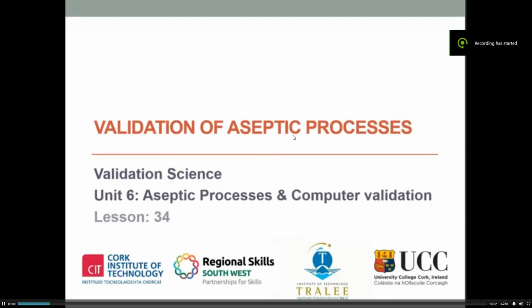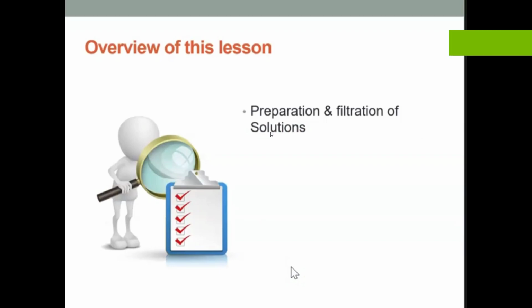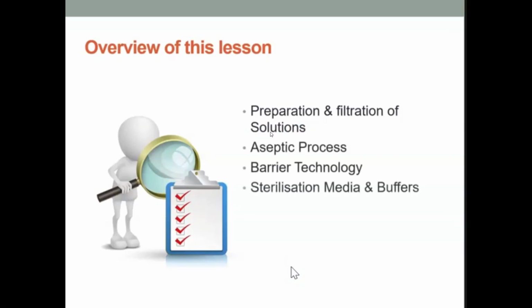Welcome to Lesson 34, Validation of Aseptic Processes. In this lesson, we're going to be looking at the preparation and filtration of solutions, aseptic processes, barrier technology, sterilization of media and buffers, filter validation, and media fills.